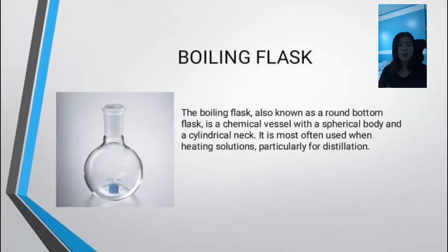The next one is the boiling flask. The boiling flask, also known as a round bottom flask, is a chemical vessel with a spherical body and a cylindrical neck. It is most often used when heating solution, particularly for distillation.